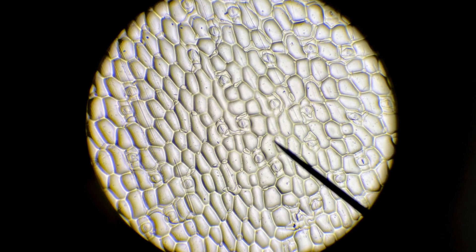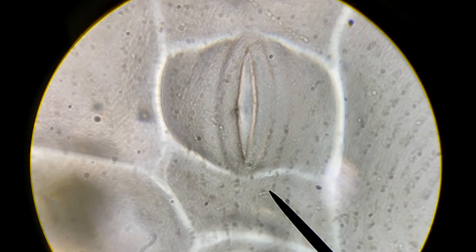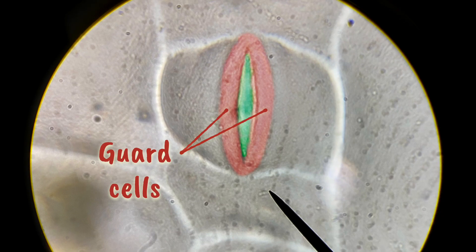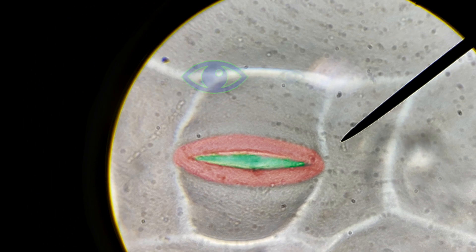You see that? Brilliant. If we look close up, we can see guard cells either side of a stomatal pore. The word stomata comes from the Greek word for mouth, and it's pretty obvious why.